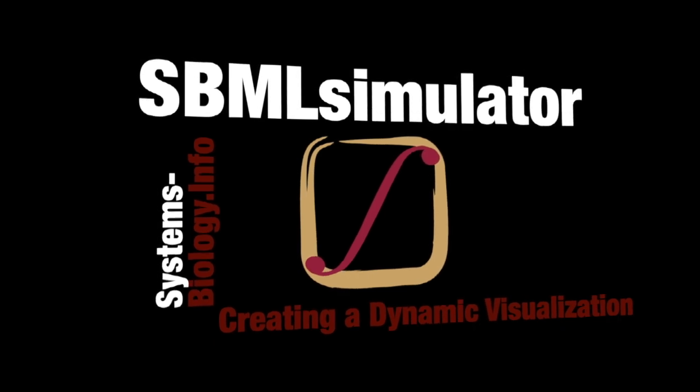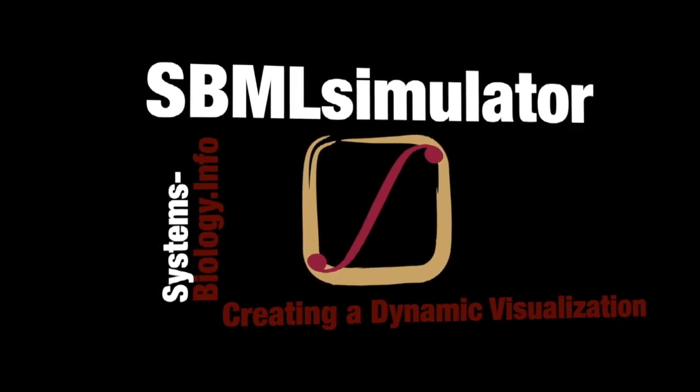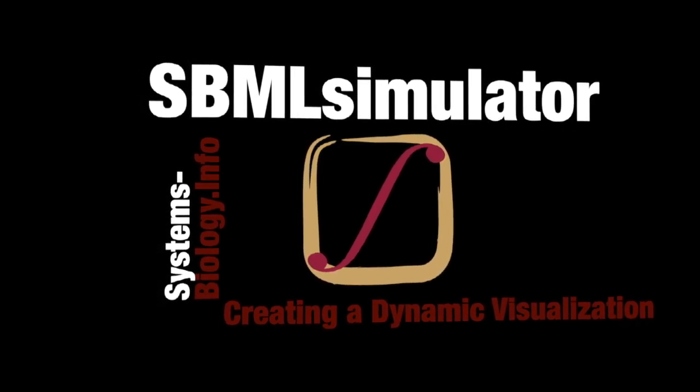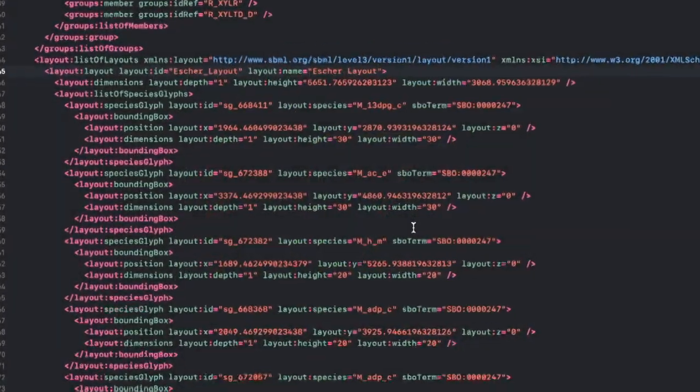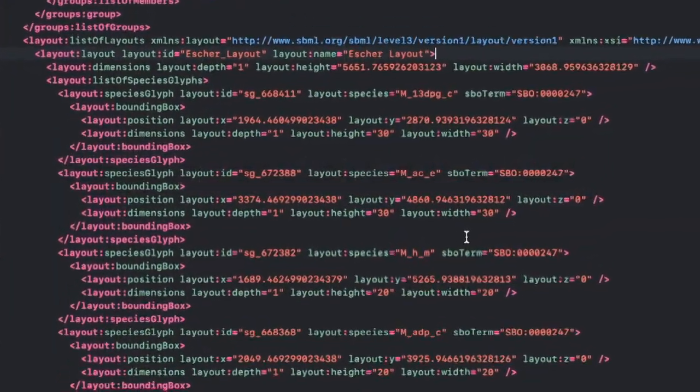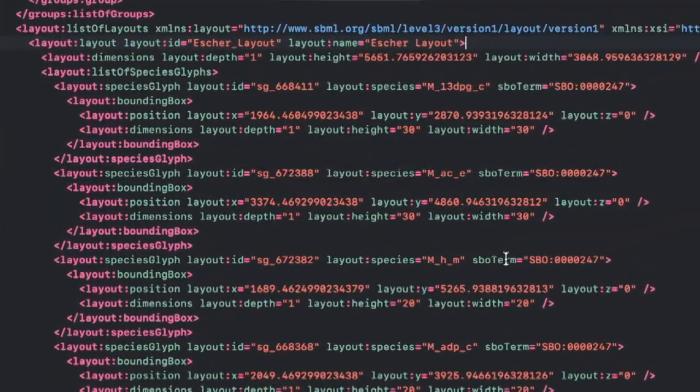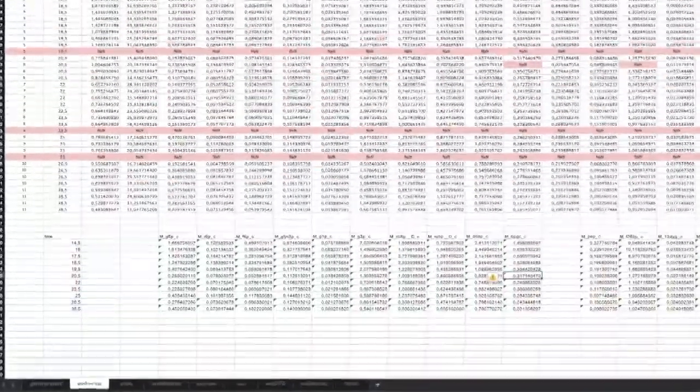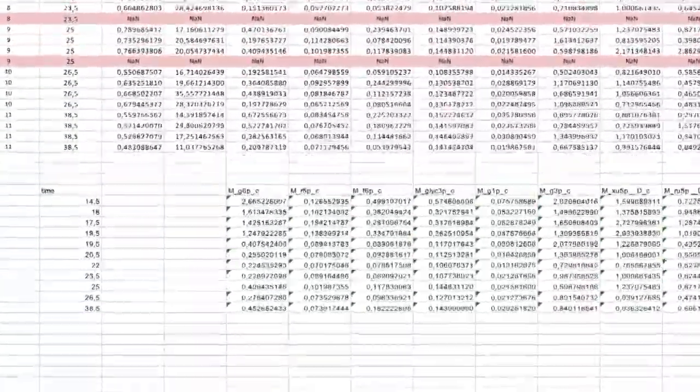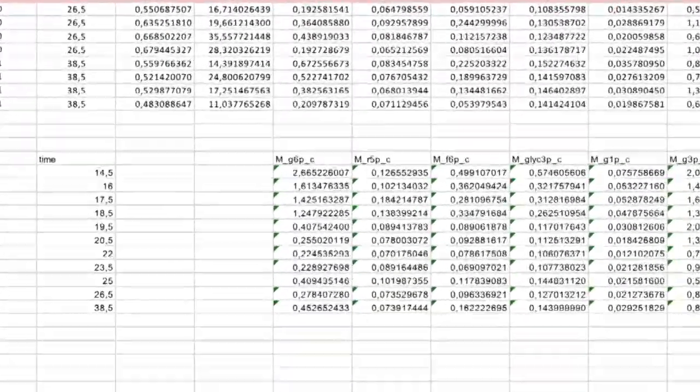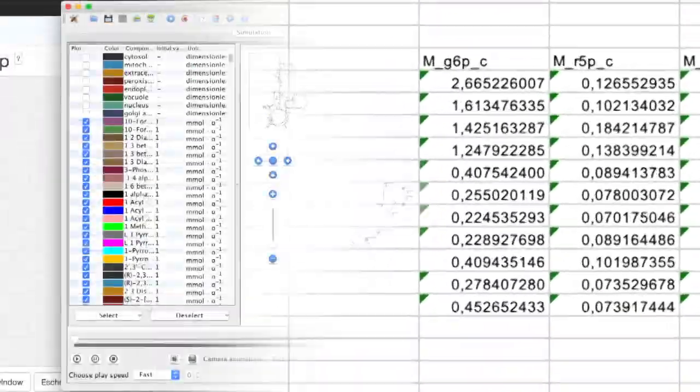In the previous video, we embedded a manually created metabolic map of the central carbon metabolism of baker's yeast in the SBML file IMM904. Next, we prepared a character-separated value file from the time course dataset that Bergdahl et al. published in 2012.